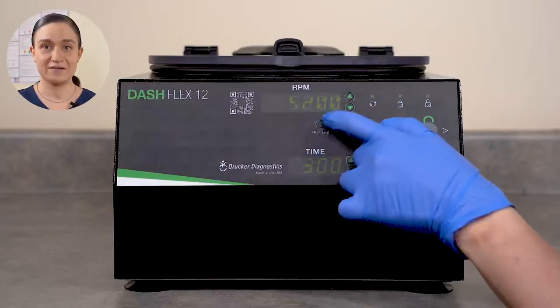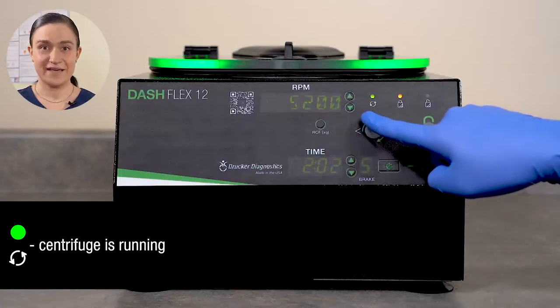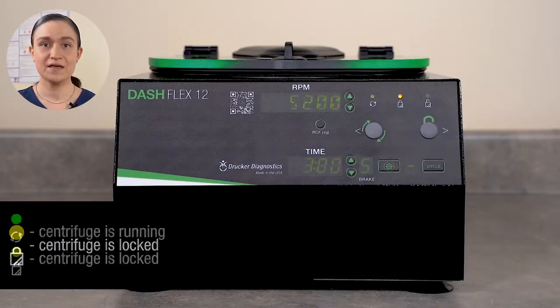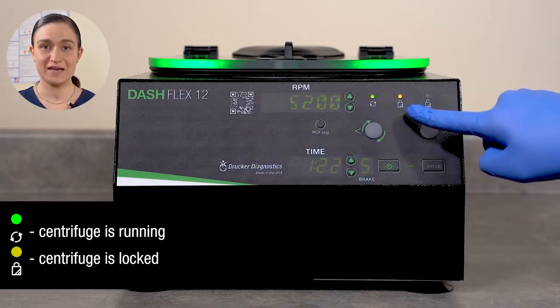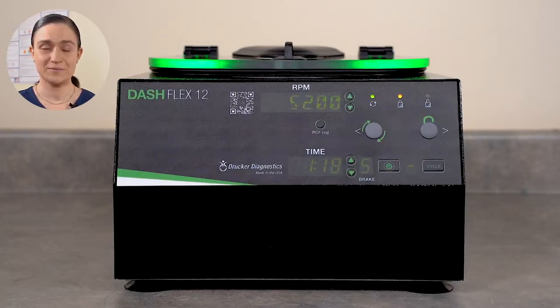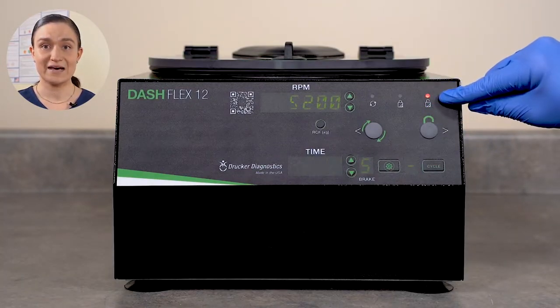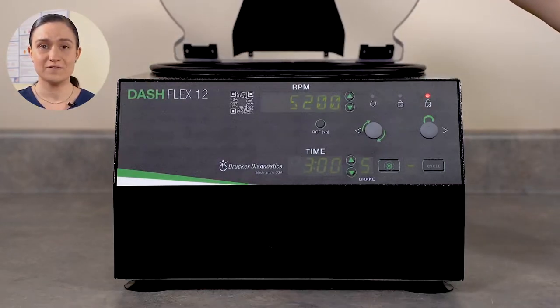The three indicator lights show the status of your Dash Flex 12. The left light is illuminated when it's running. The middle light is illuminated when the lid lock is engaged. The lid lock automatically engages when the centrifuge runs, so anytime the left light is illuminated, the middle one will be too. The right light shines when the lid is unlocked. The lid will automatically unlock at the end of the cycle, so you can twist the latch open and remove your samples.